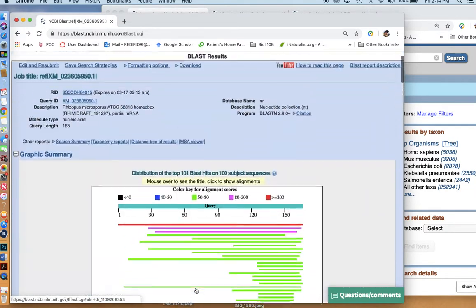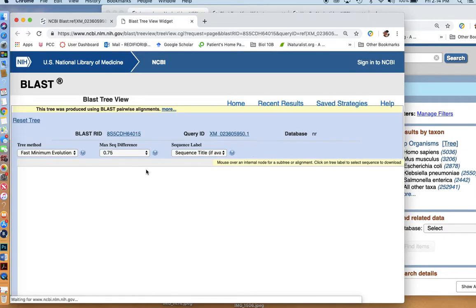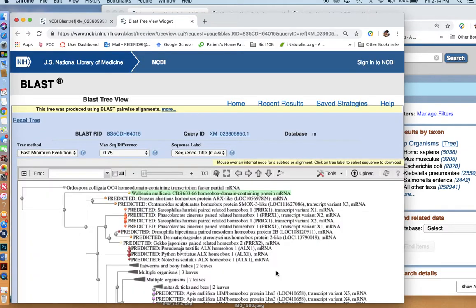You can scroll down and look through all the different alignments. But I find the easiest thing to do right away is to go to the distance tree of results.